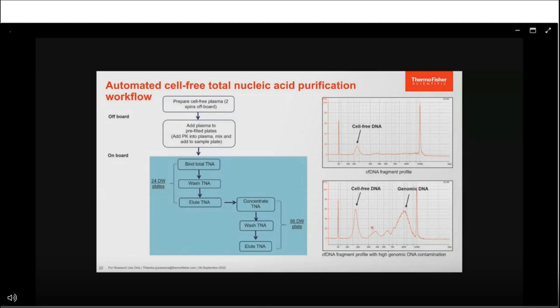Since we are processing large amounts of sample — up to 8 mL of plasma per run — the instrument first binds the TNA, washes it, then elutes in a larger volume of elution buffer for efficient elution without losing the small amount of TNA present. The eluted TNA is then concentrated and eluted again in a smaller volume suitable for downstream NGS applications. Two different cfDNA extraction profiles are shown: the desired one with only cell-free DNA and no genomic DNA contamination, versus an undesired profile with high genomic DNA contamination, which can result from any missteps in sample collection through extraction.